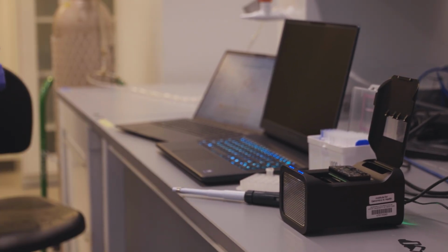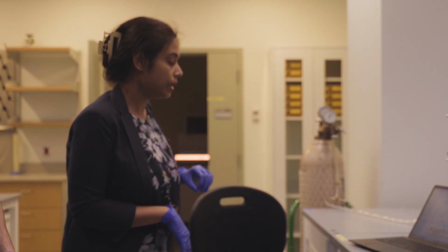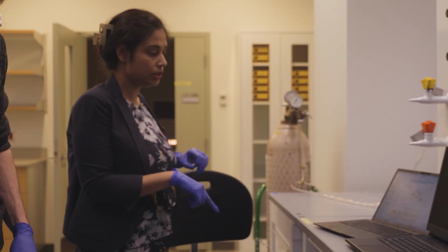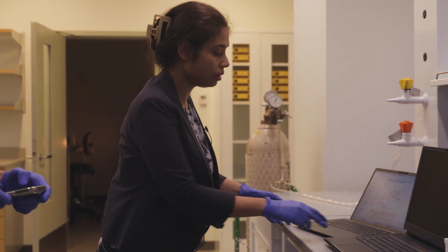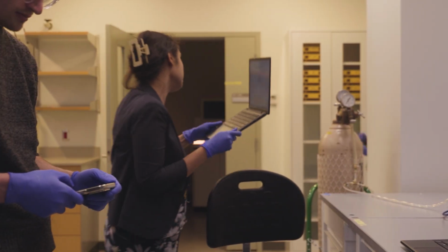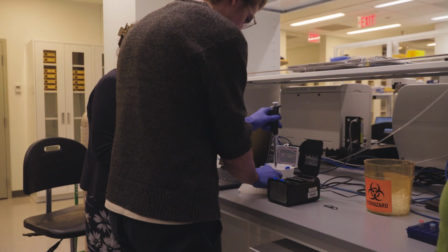Okay, so this is now 5 minutes incubation. Do we keep it like this or do we flip the slide? This is fine. So what else? I think the elution is done. So we can now prepare the loading mix. Oh, you are eluting, right? The incubation is done.